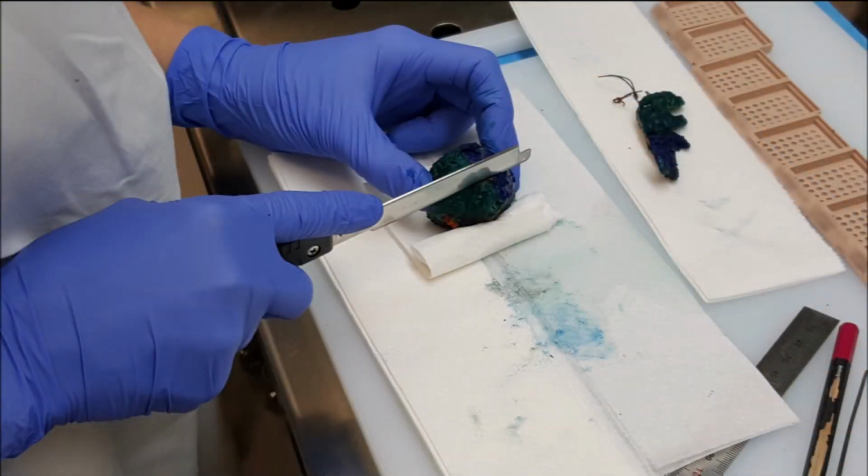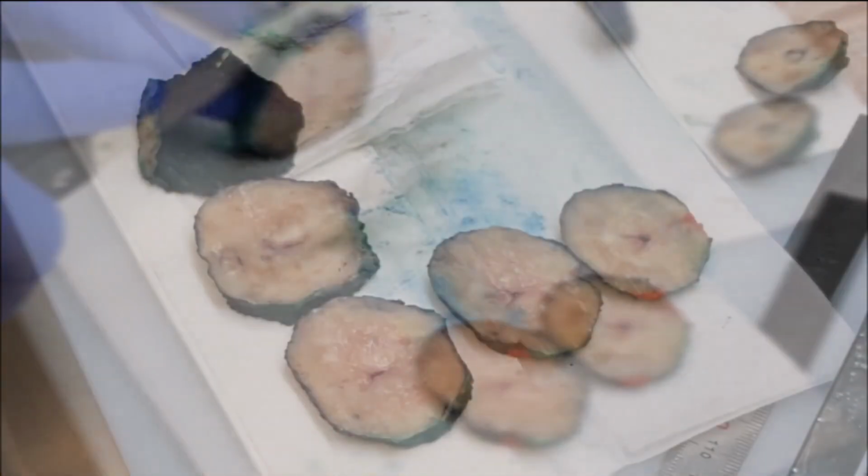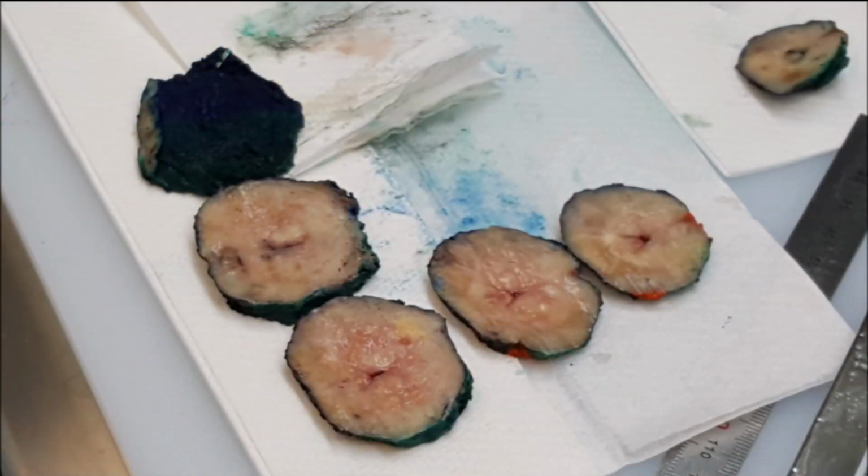Initially, the apex and base of the prostate are sectioned axially and put aside. The body of the prostate is then axially sectioned. Here, we can appreciate the tumor macroscopically in the anterior and left lateral zones of the prostate.